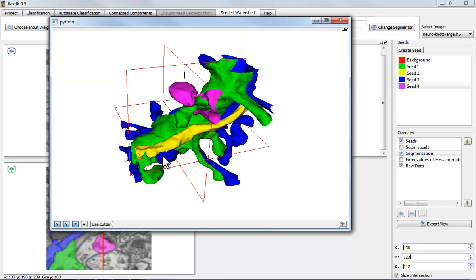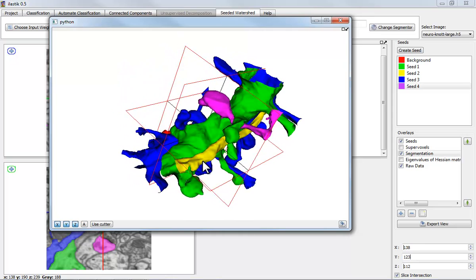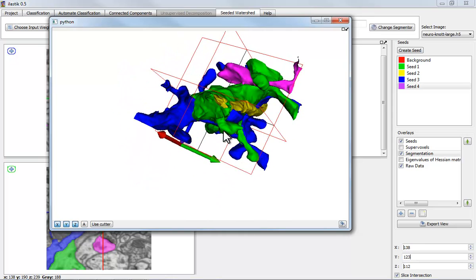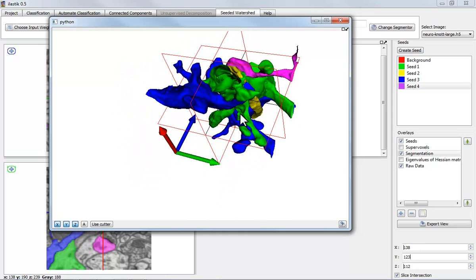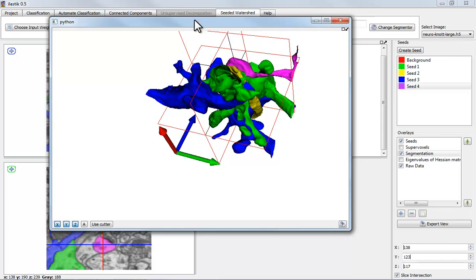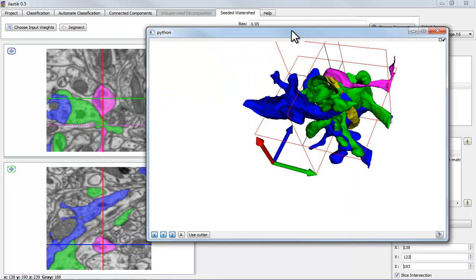If there is a particular place which you want to investigate in more detail, you can also grab one of these panes and move them around to the position of interest. And this will synchronize with the orthogonal views.